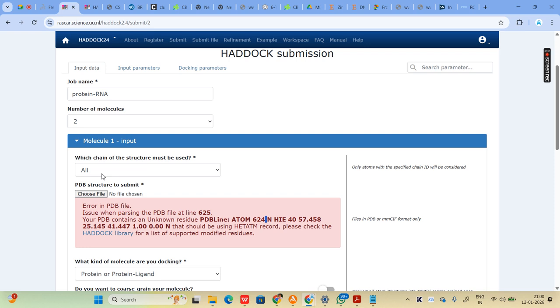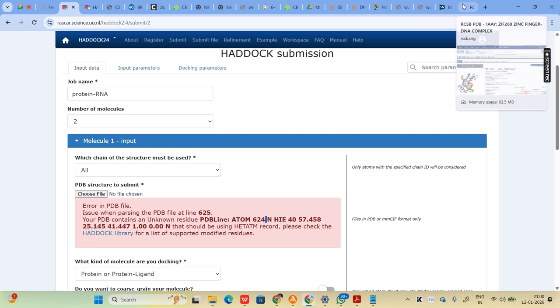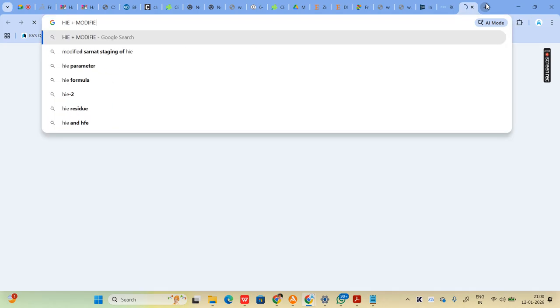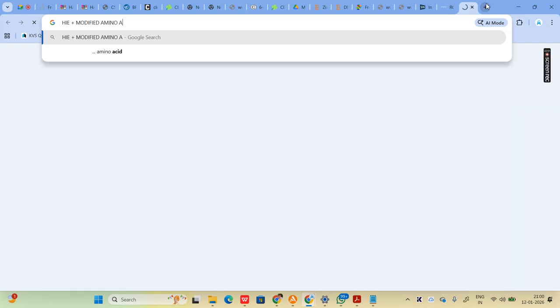What's HIE? So you don't know what is HIE. HIE, plus modified amino acid.